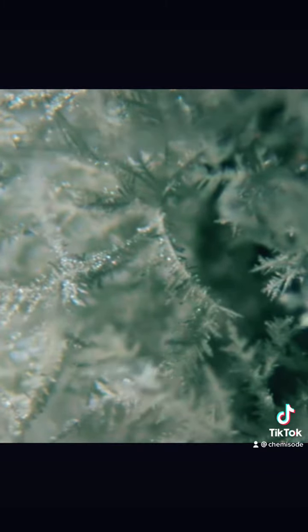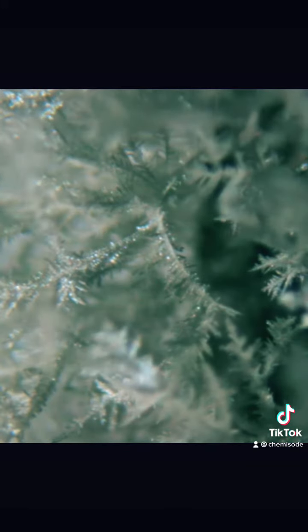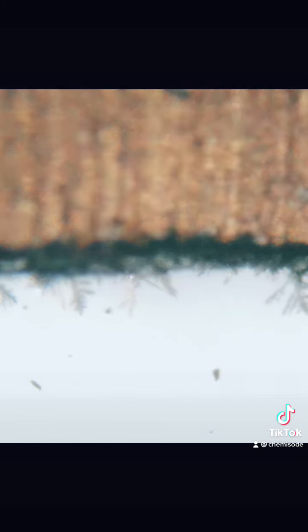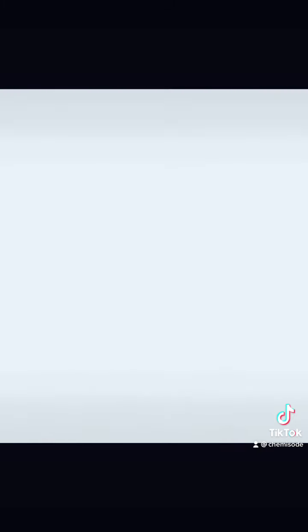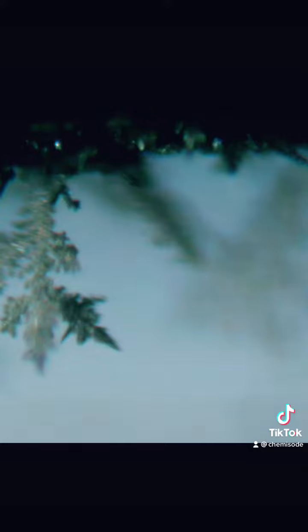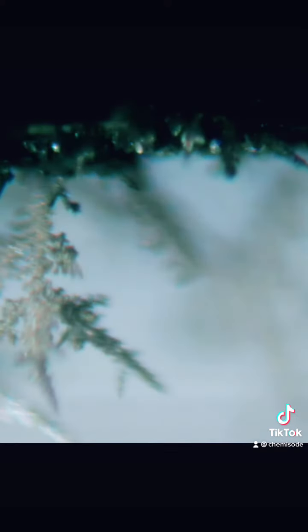Now here are a couple of other beautiful images of these silver gardens growing. This one in particular I quite like because it's showing the formation, and then I'm going to switch from 40x magnification to 100x magnification. So this is a great demonstration of redox reactions and the reduction of an ion to form a solid metal.